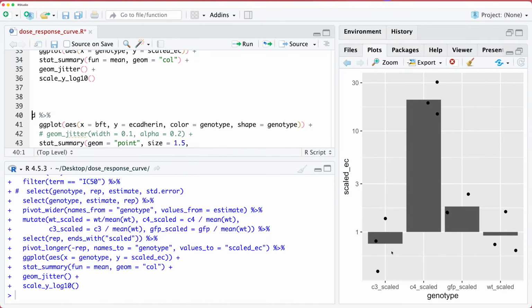There is a way to get these bars to start down here and to go up on a log scale. I'm not going to show it to you because I agree that's a bad practice and I don't want to waste our time doing that. I want to move into integrating this data in with those curve fits. There's a way to do it, but it's hard. And so it's opinionated in that bad things are hard to do.